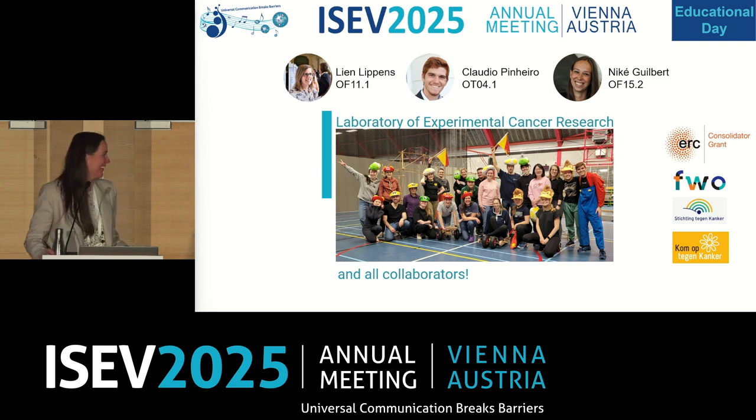Okay, very last question from Evie. Thank you very much, Wolf. So very quick, immunoisolation. What are your considerations there? For? I missed the first. Immunoisolation of EVs, in terms of specificity and efficiency, and maybe you could spend a few words on that.